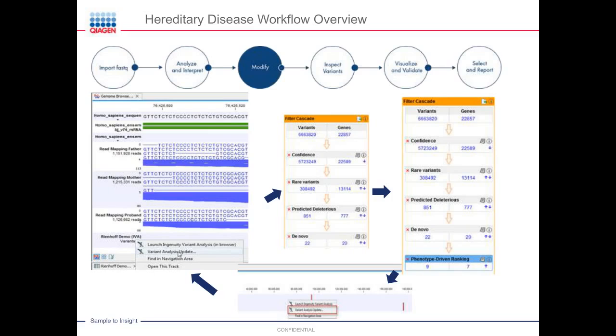which does different kinds of filtering. So for example, it filters out variants which are common in the population. It keeps variants which are pathogenic or likely pathogenic, are present in HGMD, or meet different other criteria. And then also it does the filtering for a specific inheritance pattern.